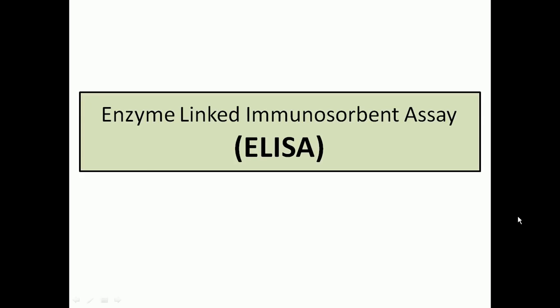Welcome back, guys. In this video tutorial we'll be talking about the enzyme linked immunosorbent assay, or simply known as ELISA. ELISA is a very sensitive technique to detect the presence of antigen or antibody in blood, right? So that's why we use ELISA.